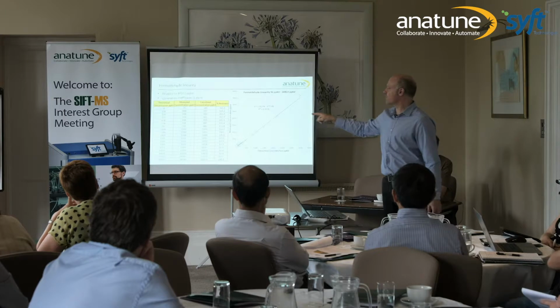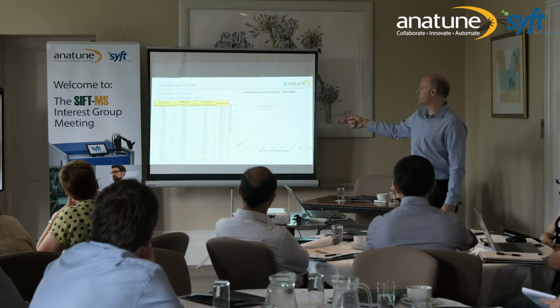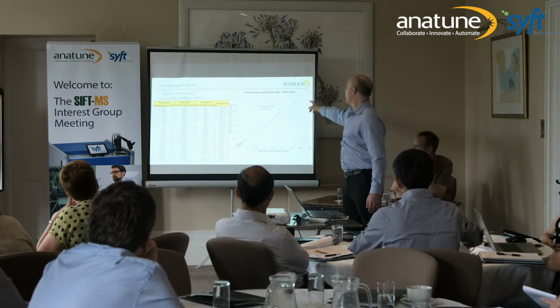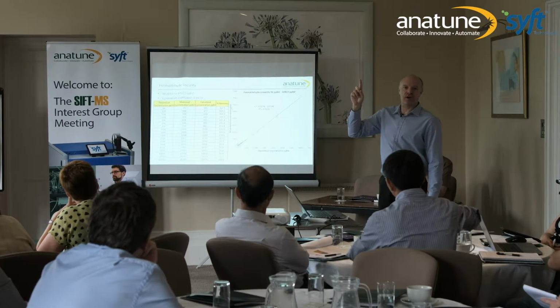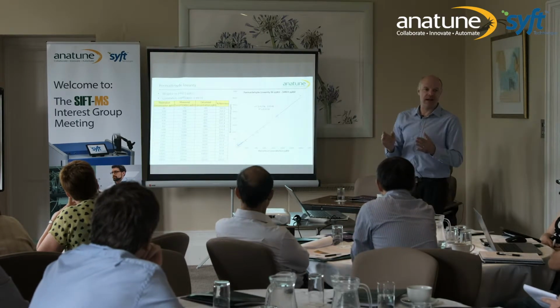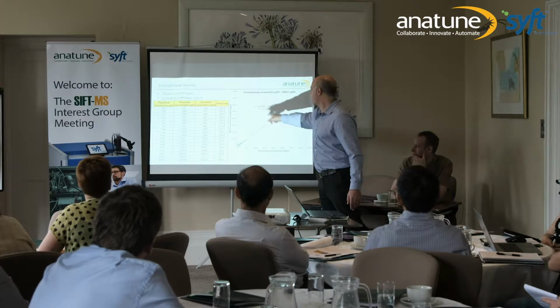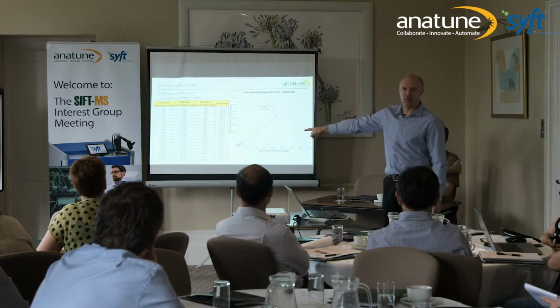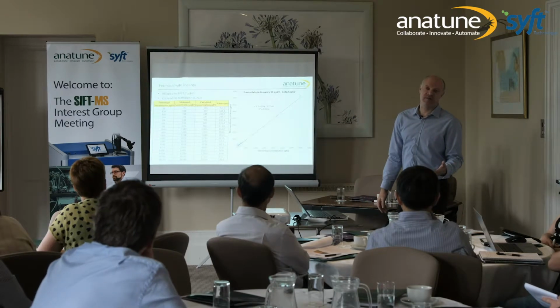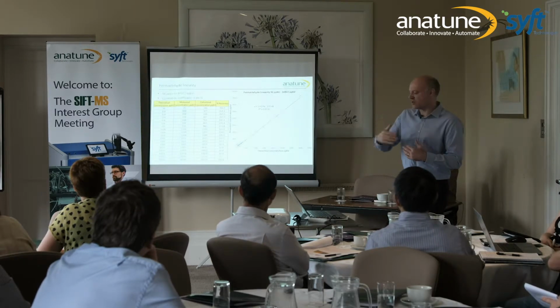And you can see at the low concentrations, we're massively over-recovering according to our calibration curve on this linearity. And the reason for this, if you look closely, is this point up here, the 35 ppmV point, is actually pushing off the curve a bit. And because it's such high concentration, it actually carries a significant amount of weight in that linearity, and so it actually skews the bottom end of that linearity curve. And this is where you're getting this over recovery, because the line is not actually running true through those bottom points of the linearity. So 35 ppmV didn't need to go that high for the method anyway, and it probably was pushing the top end of the SIFT sensitivities at that point anyway, or the SIFT limits.